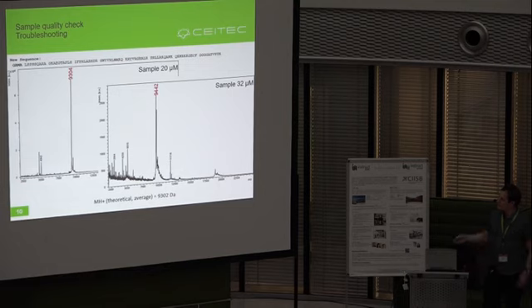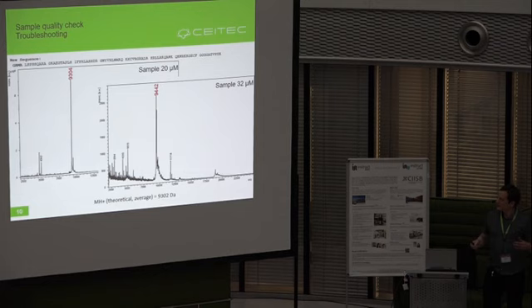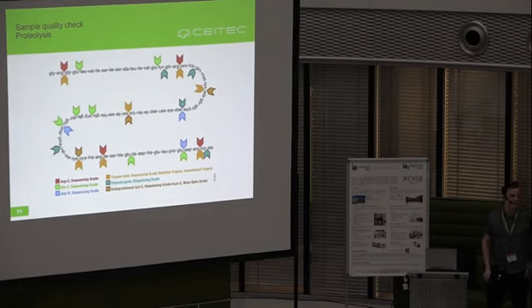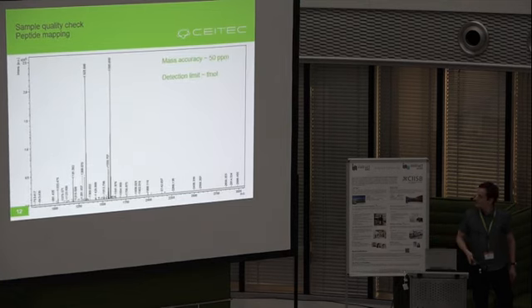So we could deduce that it could be some other modification, some uncleaved tag, or could be a totally different protein. For that purpose, we must analyze the sample in a more sophisticated way. Routinely, we digest it by some protease. The first protease of choice is always trypsin, which cuts the protein into peptides, and the subsequent mass spectrometric analysis will reveal the molecular weights of the peptides.